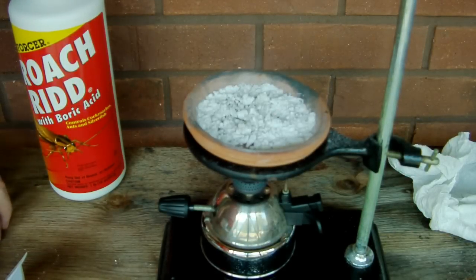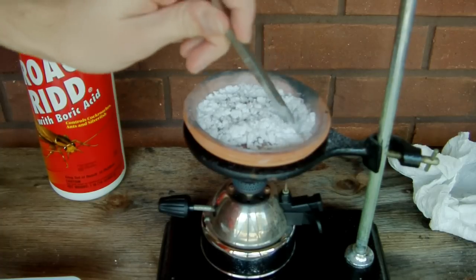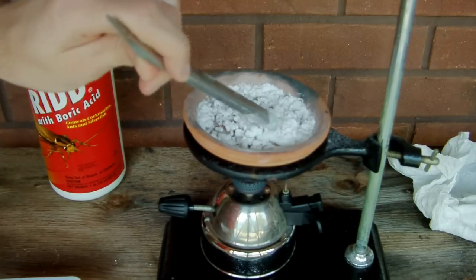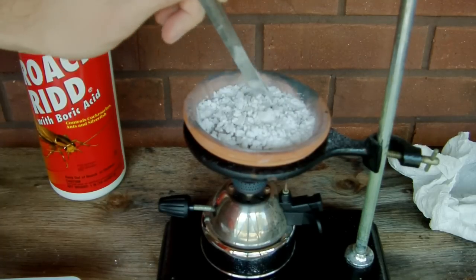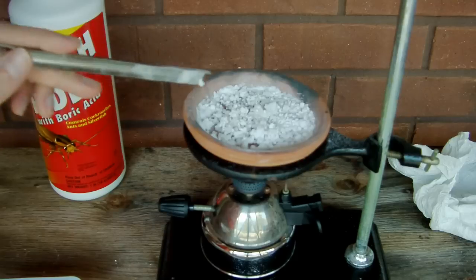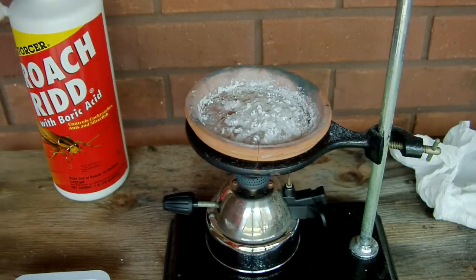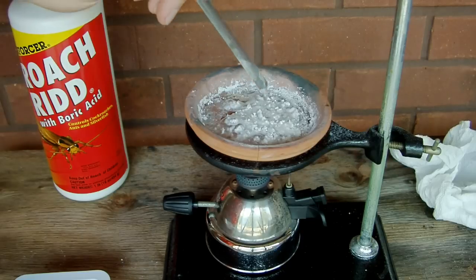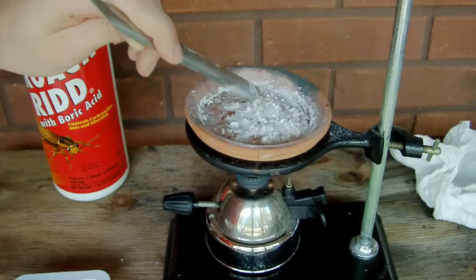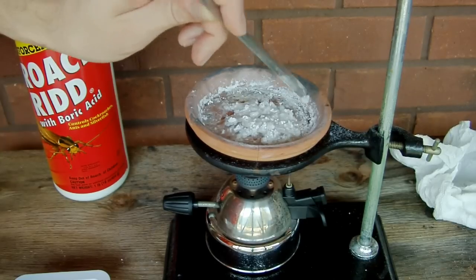I've been heating for about 10 minutes now and you can see the water is coming off as steam, and the boric acid has clumped up significantly as boric oxide is formed. It's also discolored slightly — whereas boric acid is a bright white, a couple of these chunks have darkened a bit. This stuff is turning into a really sticky, thick mass that just keeps bubbling up, so I'm just going to keep poking at it to get everything evenly heated.